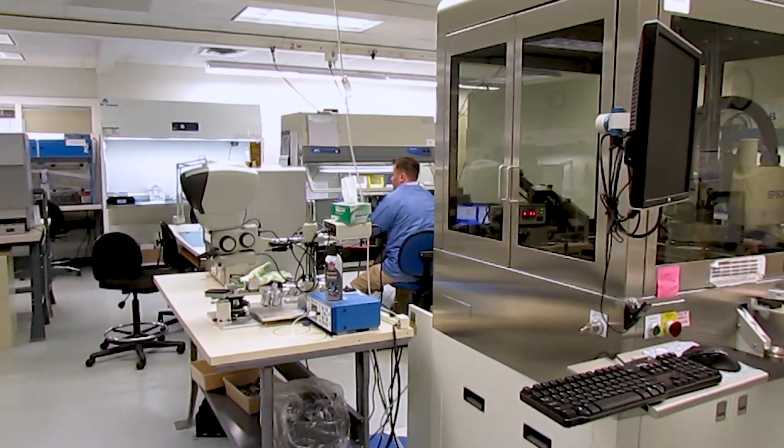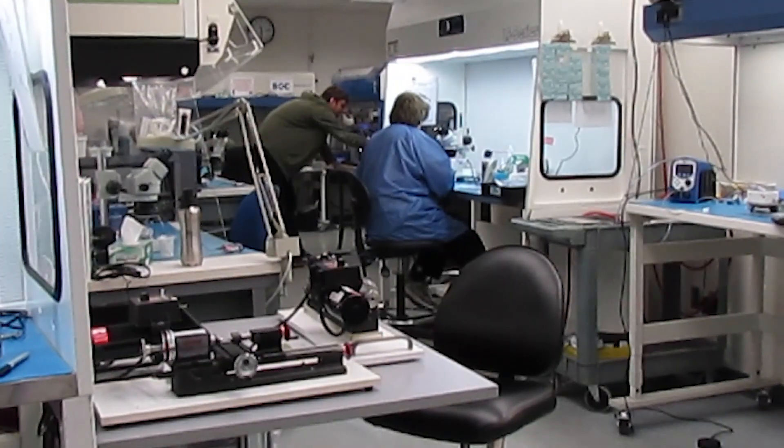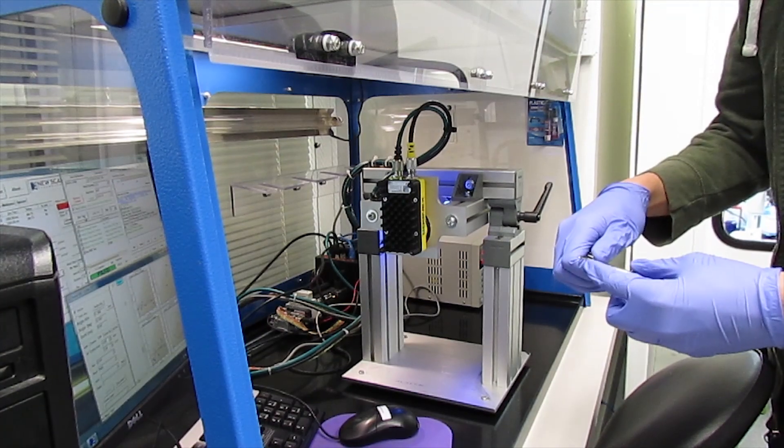Over more than 15 years, NewScale's Micromotion products have become known for their ease of use, reliability, and precision.